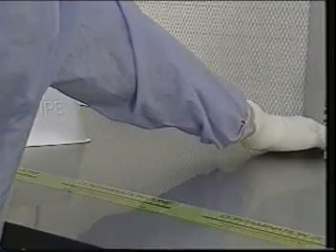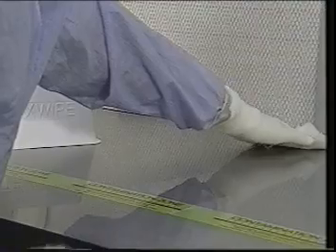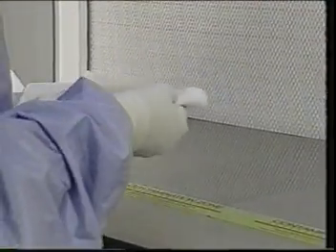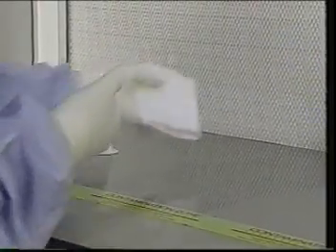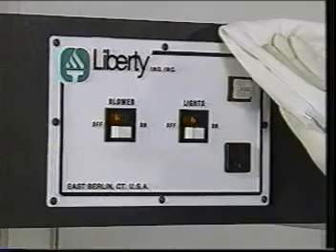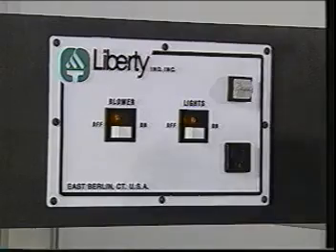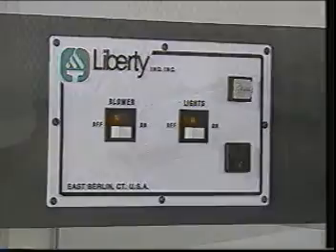To avoid recontamination, you should keep track both of the surfaces you've already cleaned and the areas of your wiper which are unused. Always wipe the cleanest surfaces with the cleanest areas of your wiper. If you're re-wiping a surface, apply only the unused portions of your wiper to it. In certain cases, you may be required to use a dry wiper alone on surfaces where liquids or solvents are prohibited.